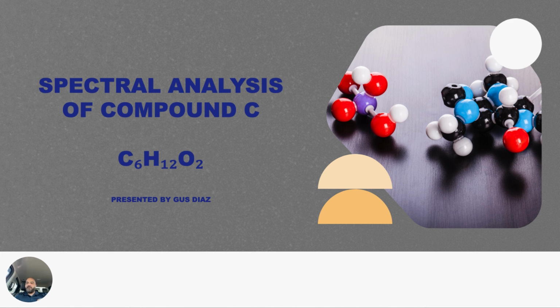The molecular formula is C6H12O2, and I use IR, 13C NMR, and 1H NMR to identify the unknown compound. Spoiler alert, we're headed towards a methyl ester with a twist. Let's get started.